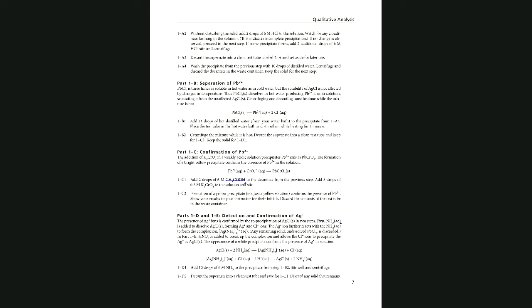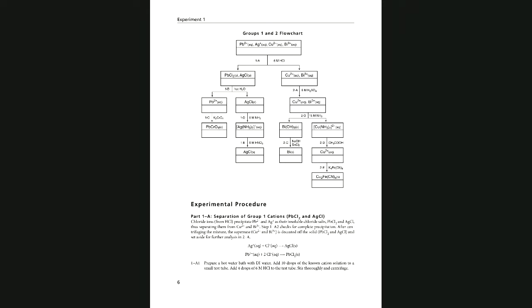Okay, after the flow chart, in the last page, we start with the procedure. So let me go ahead and start with the procedure because I want to make sure I have enough time to perform the experiment. And then if you have any questions, if I'm teaching the class, you ask me. If another professor is teaching the class, you could ask your professor about any questions that you might have. Make sure you record your observation carefully, because that would be your good friend in order to identify your unknown.